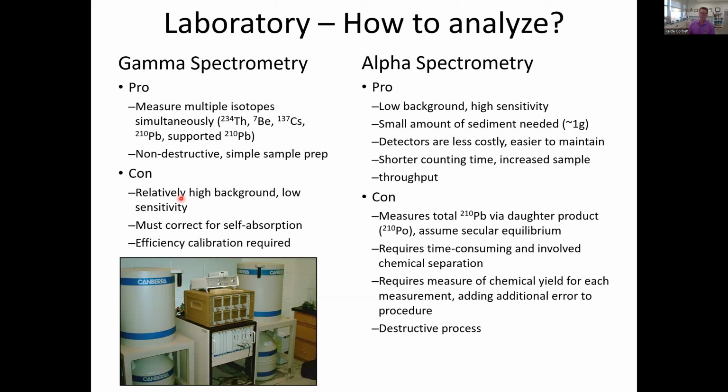You've got to clean these samples up through a geochemical separation, typically a digestion procedure. I can usually run through about 40 samples in about 2 days in my lab. But again, that takes 2 days to prep these samples, 40 samples, to get them ready for counting. And it is a destructive process. You cannot reuse those samples once you move through that digestive process. So again, you have sort of positives and negatives to both of these.